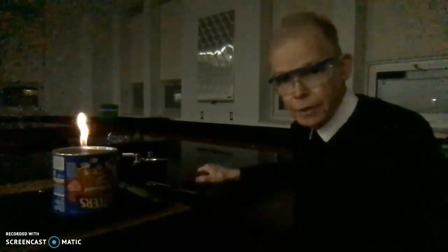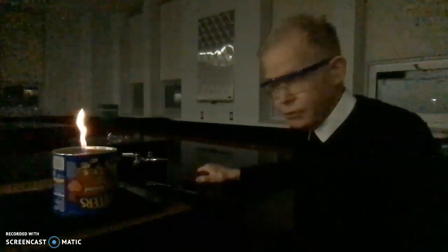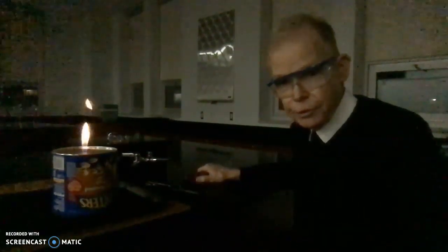As I mentioned in the first video of these three types of reaction, as the fire proceeds here, a little bit of air is coming in at the bottom of the can, so the can is now starting to fill up with a mixture of air, which has oxygen in it, and also the methane.